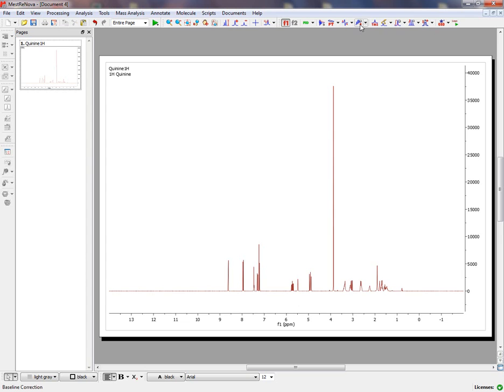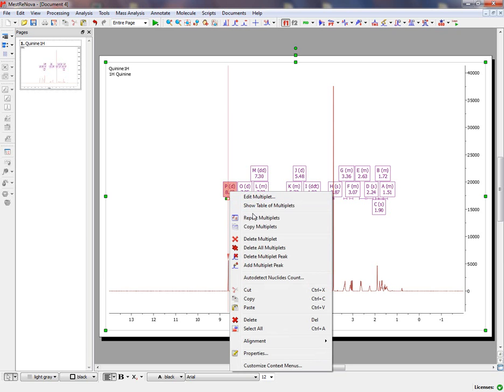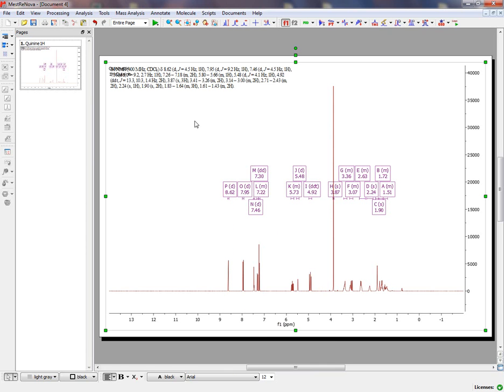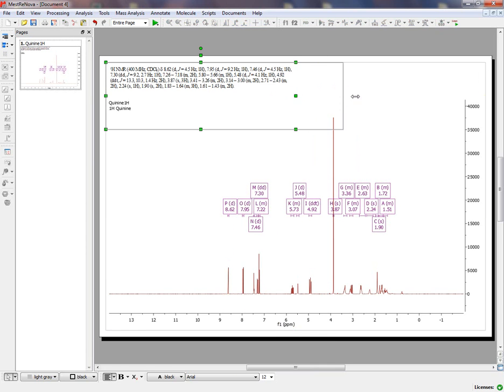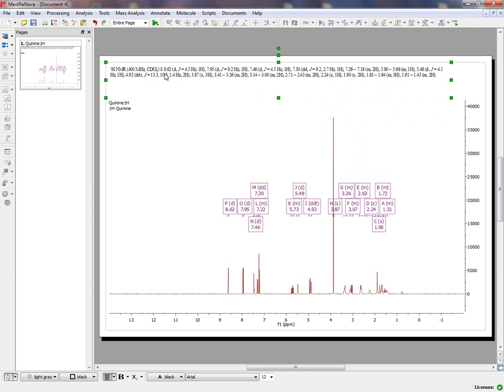a baseline correction, an automatic baseline correction, followed by a Multiplet Analysis Report just by clicking here. Once you have the Multiplet Analysis Report, generate the Multiplet Report by right-clicking on the multiplet boxes and selecting Report Multiplets. You will get the Multiplet Report with information about the chemical shift, the type of signal, the coupling constants, and the number of Hydrogens.